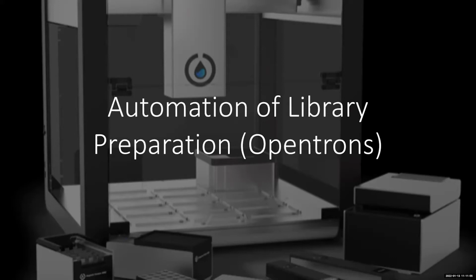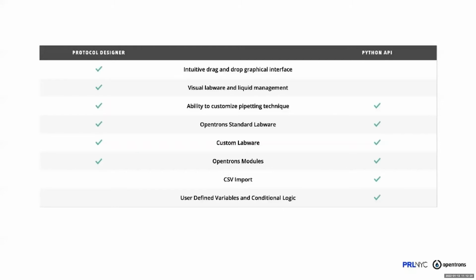And the easiest way is to use some form of liquid handling robot. Now, admittedly, certain robots, such as those made by Tecan and Hamilton, can have quite a high degree of difficulty for the user in terms of just getting accustomed to them. The UI can be a little bit alien when you first start using them. And also they can be prohibitively expensive for a number of labs. One of the other issues as well is that you can have a certain amount of labware that is incompatible, and you will need to buy it from certain suppliers, and this may not be available if everyone else is trying to acquire the same labware.